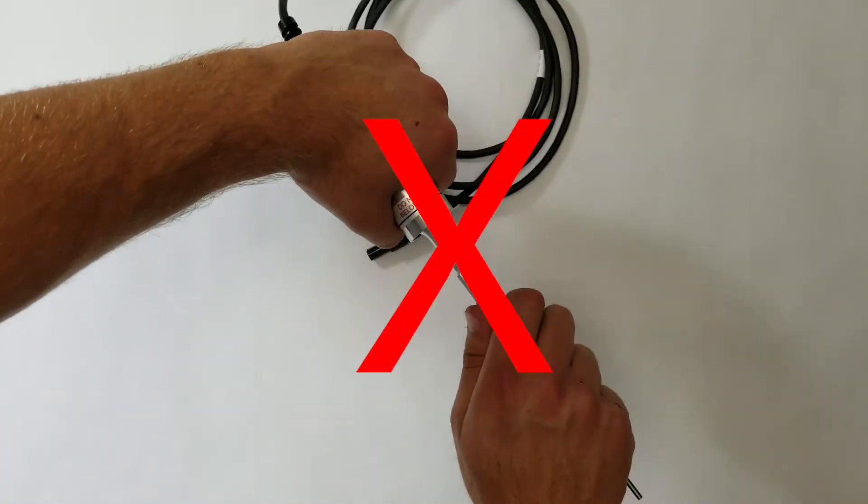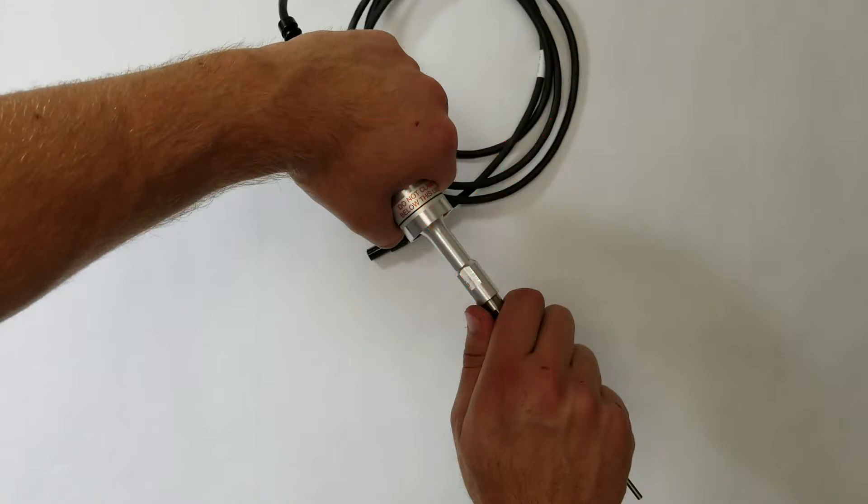Never attempt to fully tighten the probe to the converter just by hand or using only one wrench, as you could damage the converter. Always use two wrenches.